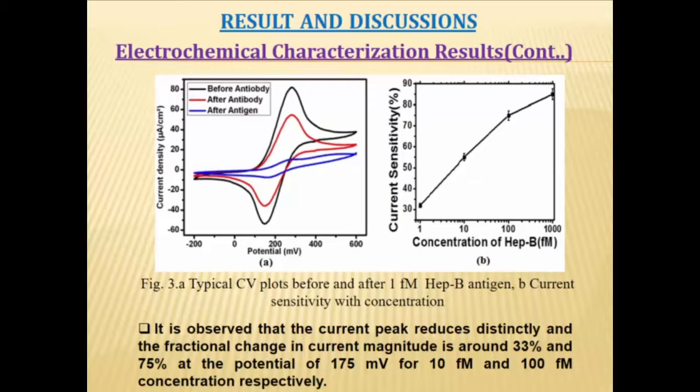We found the oxidation and reduction voltages are almost the same, but we observe that the current value is reducing.